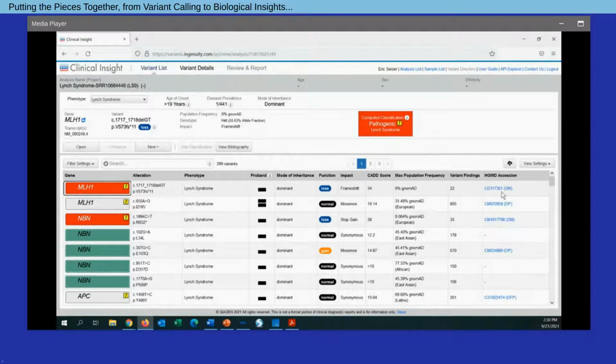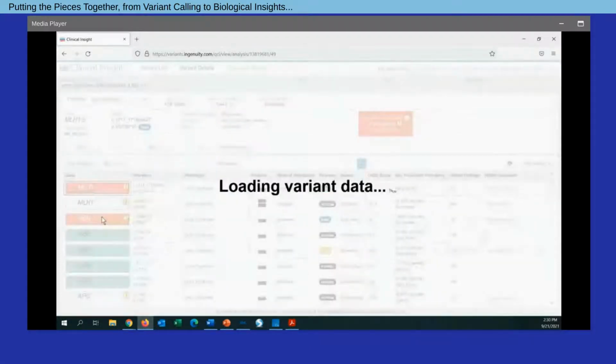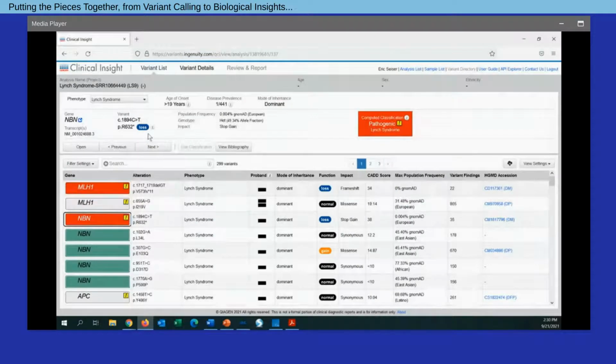Now, in this context, for any variant of interest, what we would have the ability to do is one of two things. As we select a variant in the table, you'll notice the top of the screen changes. Within the top of the screen in particular, we'll have variant-specific details towards the left-hand side, and towards the right, we can see the computed classification based on ACMG guidelines.